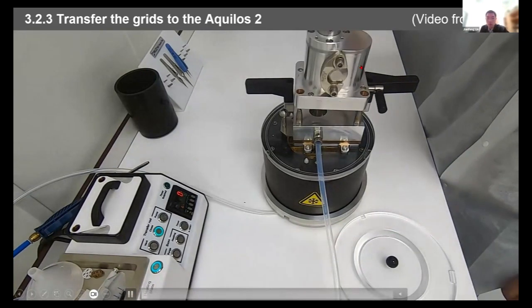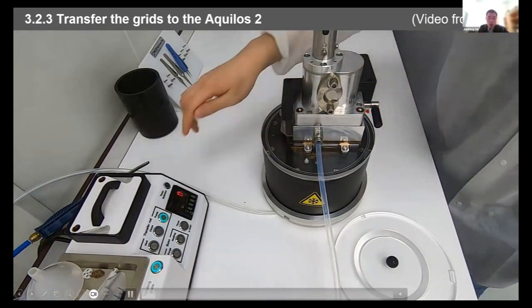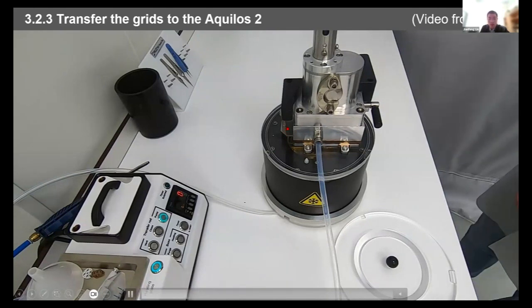First, you will put the transfer rod here, and before you open the valve, you want to make sure this chamber is clean and dry. First, it will pump the lower part for a while, like 10 or 15 seconds. After this pumping, there is a valve at the bottom part; you will open it, and then we'll purge it, and then open it.